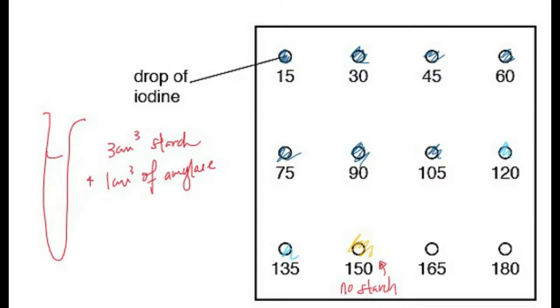Now that we are done preparing our different concentrations of amylase, we can go ahead and monitor the time course for the reaction. We're going to add 3 cm³ of starch, and then to that we add 1 cm³ of amylase, and immediately start the stopwatch. The idea is, every 15 seconds we will monitor the time course by taking a drop of the reaction mixture and putting it on the spotting tile.